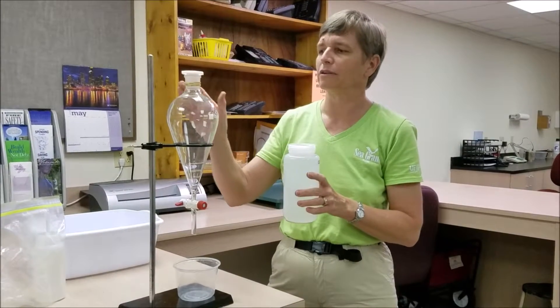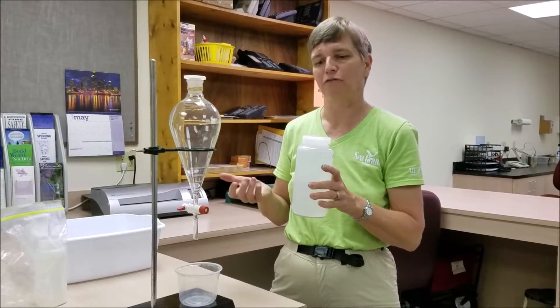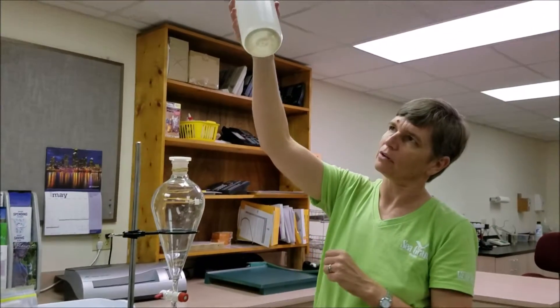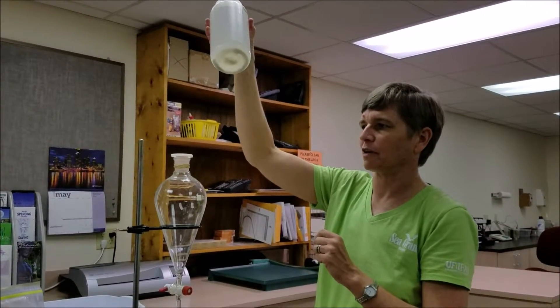We have a tool here called a separatory funnel that we can use to remove the sand from the sample and then filter the remaining water. If your sample, when you look at it from below, contains quite a bit of sand, that's when you'll want to use the separatory funnel.